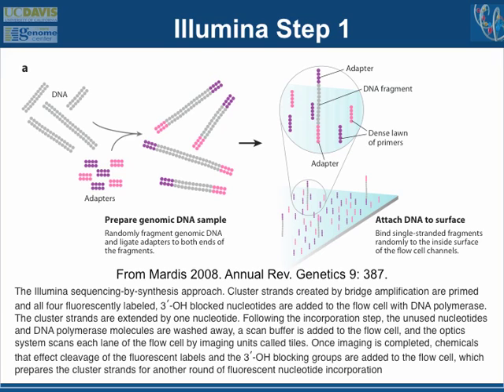So you have this little slide. It's overloaded with PCR primers. You then attach your DNA sample, sort of string it out like single-stranded pieces of your DNA onto this slide. So you have these little pillars that correspond to your DNA sticking out in this sea of PCR primers, basically.